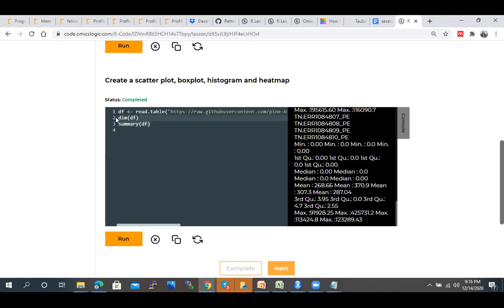Let me paste these two commands in the chat box as well. The first command, dim, will compute the dimensions of your data, that is how many rows and how many columns are there. The next is summary, which will compute the summary statistics of your data. The next is how we can perform the log scale transformation. Here we are creating an object log.